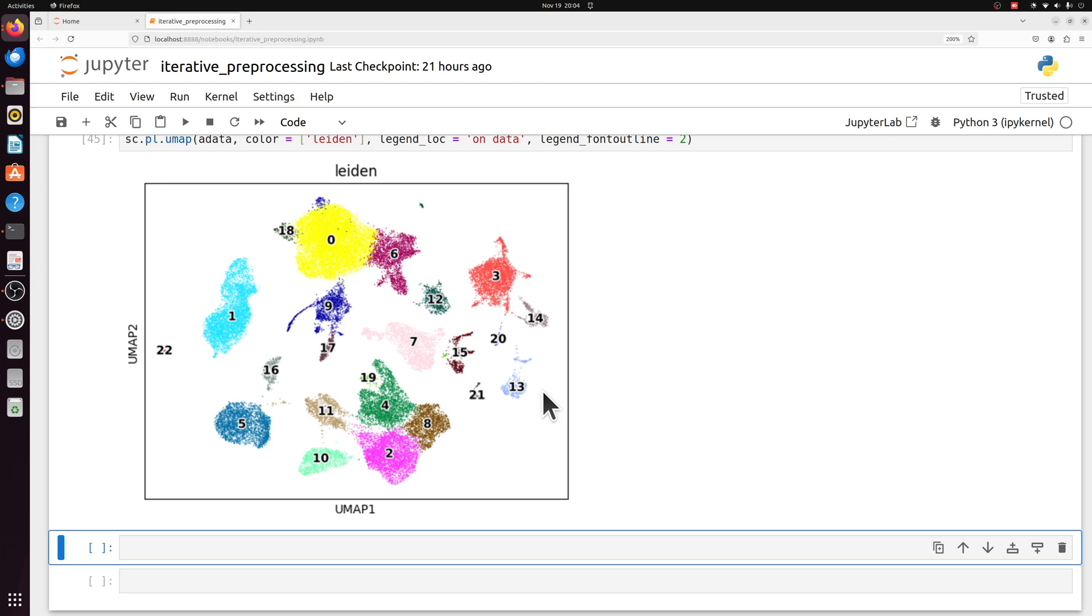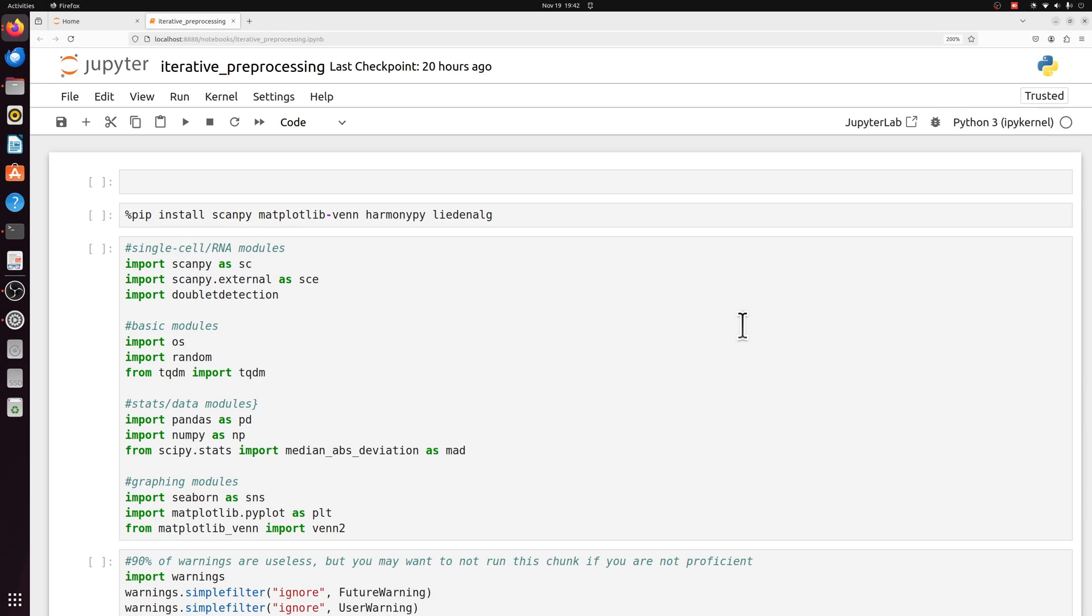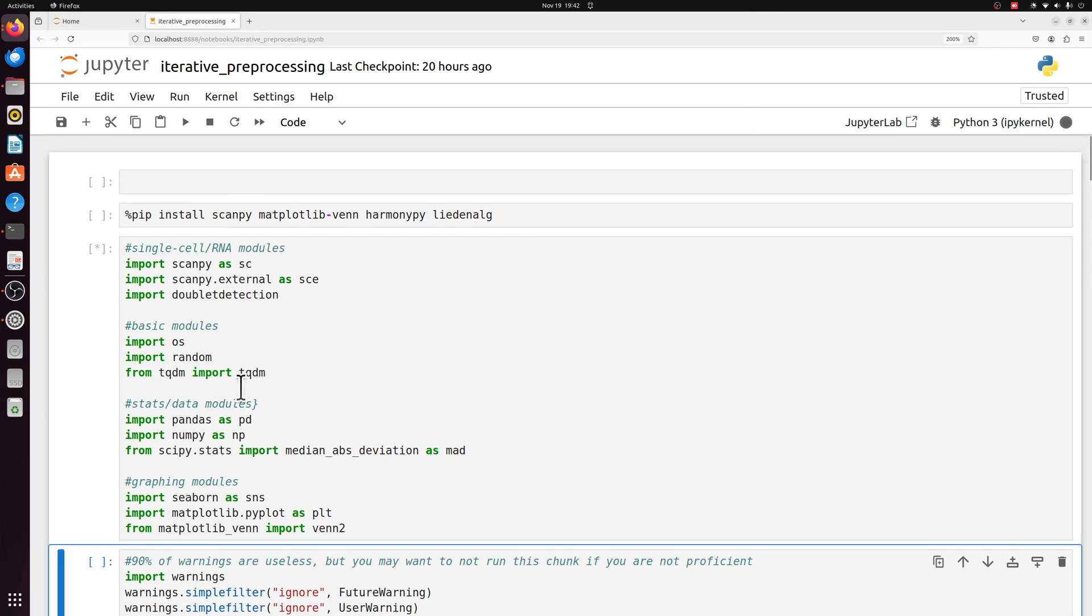We would have thrown away at least three actual biological cell populations if you don't do this. You're likely throwing away cells. In this video, we're going to cover a very important topic, which is iterative preprocessing. So instead of just doing all your preprocessing and calling it a day, we're actually going to do a round of preprocessing without getting rid of any cells, and then determining from there if they're actually outliers. That way, we're not actually throwing away any cells.